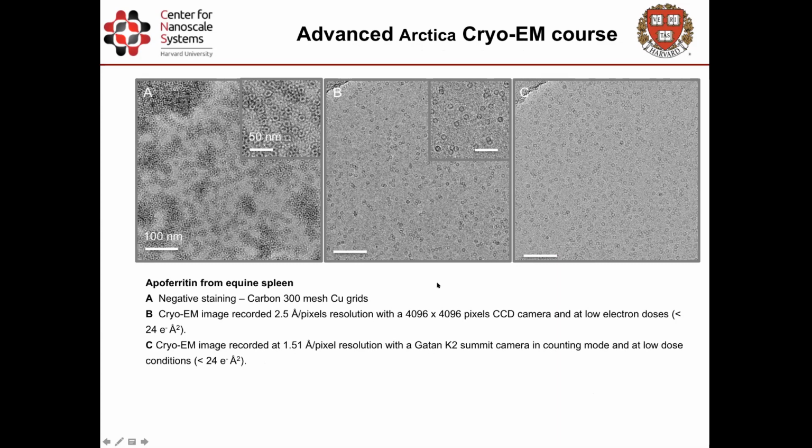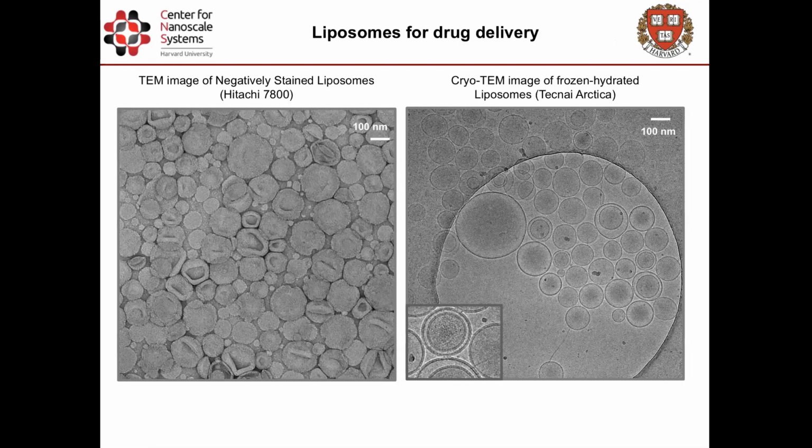And you also will need more concentrated sample. These samples are all the same concentration. Therefore, it has to be over-concentrated negative stain. This is what you're checking. If you have this concentration in negative stain, then yeah, you will get good images in cryo. You will be able to do some analysis.